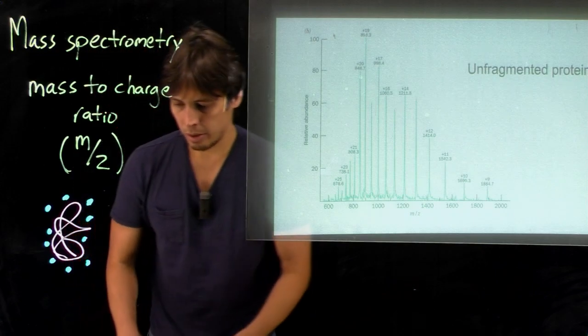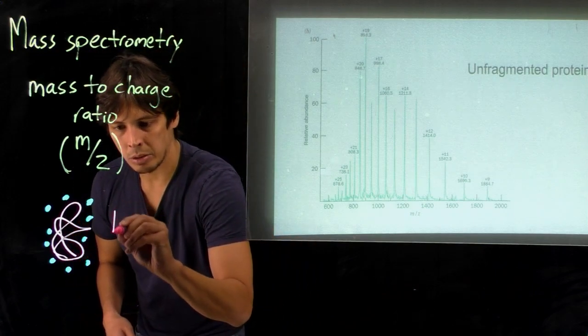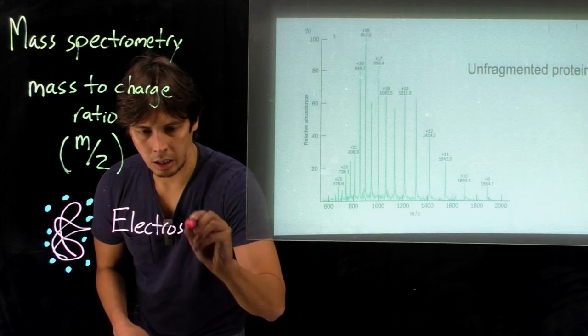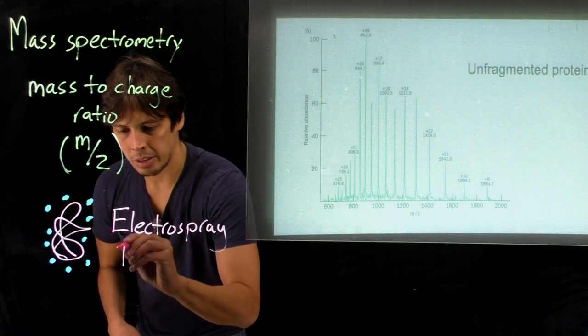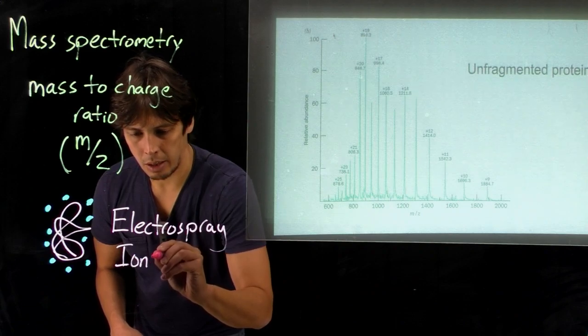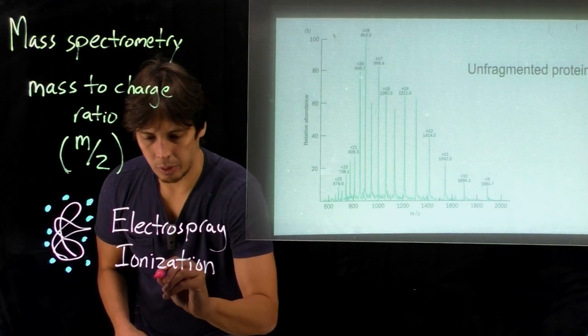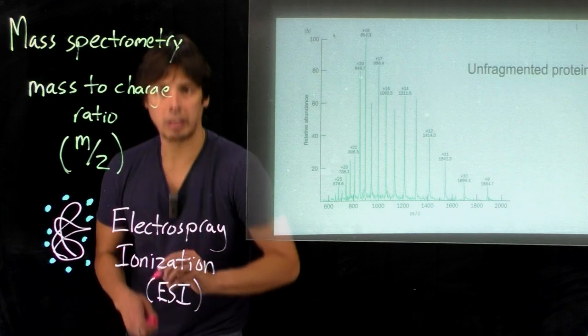And so a technique called Electrospray Ionization, or ESI, was developed in order to do exactly that.